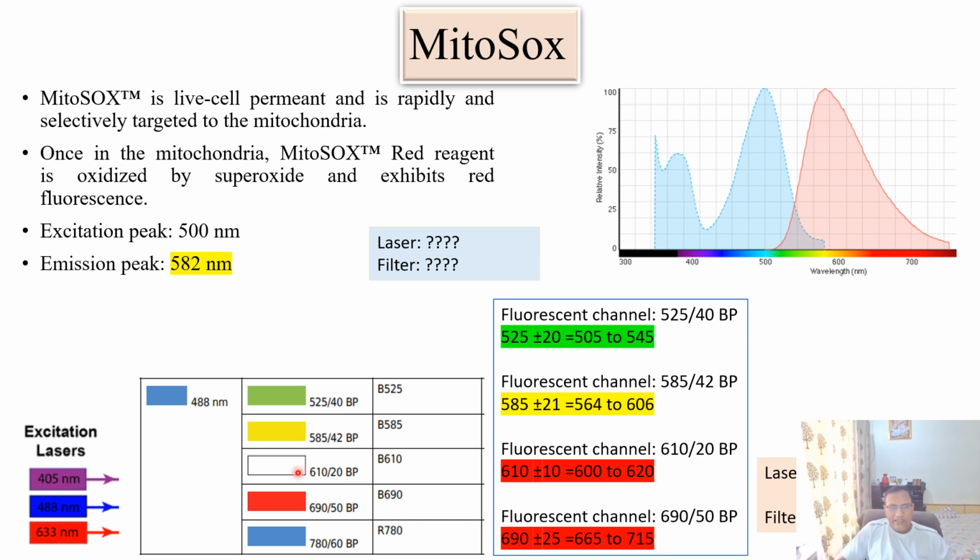It can be efficiently detected, but this filter also detects another wavelength, because the maximum is 750 and it will be detected, but the light intensity we detect in this filter will be very weak. The signal will be very weak. So we will not select this one. Again, here it could be selected. You can see the emission spectrum is 500 to 730, so it also comes in the range.